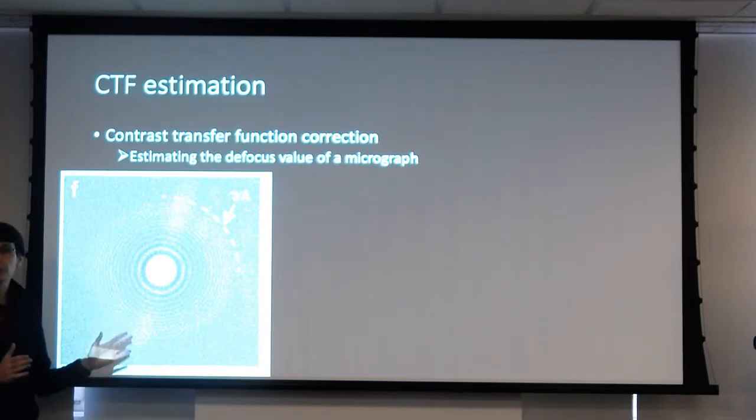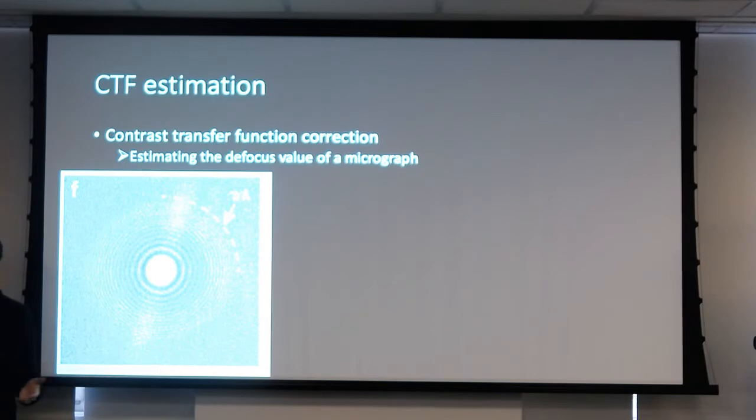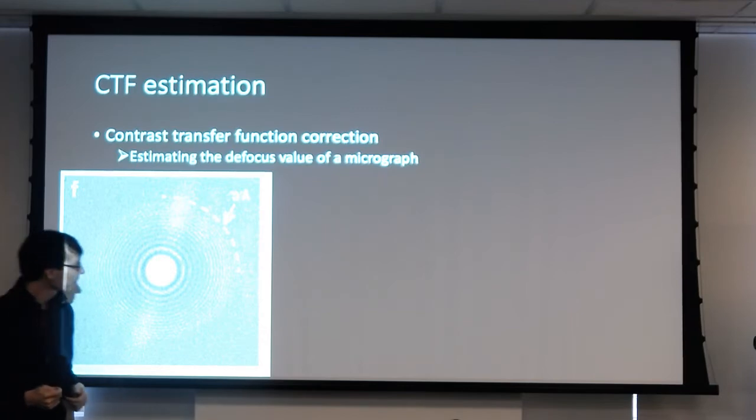And so they are supposed to be there. And so if you don't see them in your micrograph, it means they disappeared. If they disappeared, there's something that went into the way of recovering that information. That information is no longer there.